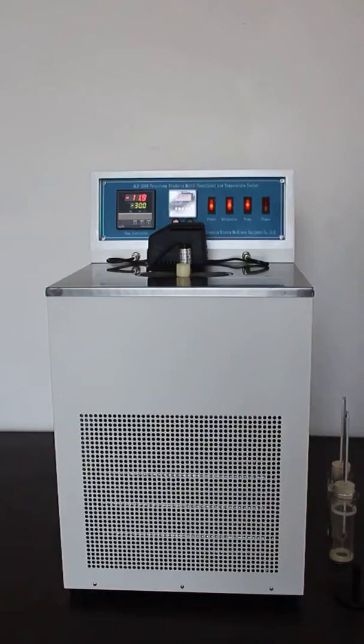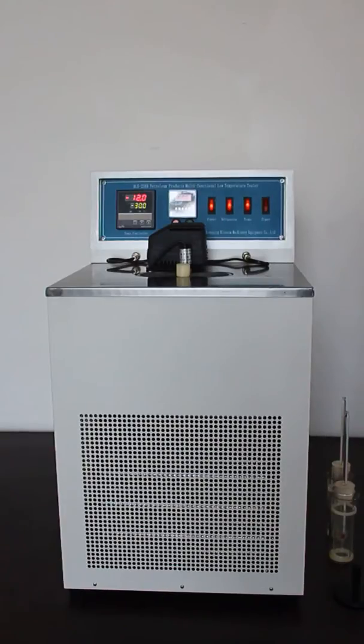This instrument is capable of pour point and cloud point test.